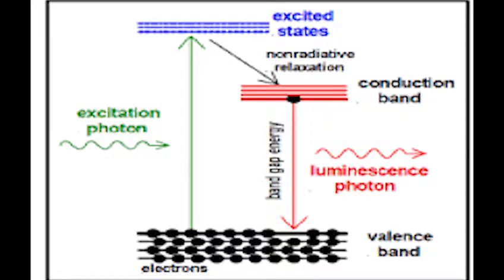Fluorescence is a type of photoluminescence, which is the emission of light by a molecule. When a molecule absorbs UV radiation, it excites from ground state to excited state. Then, the excited molecule will fall back to ground state with the emission of a photon. Fluorescence happens immediately after initial photon absorption.